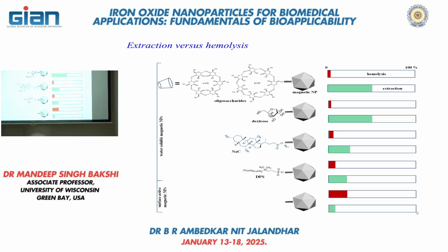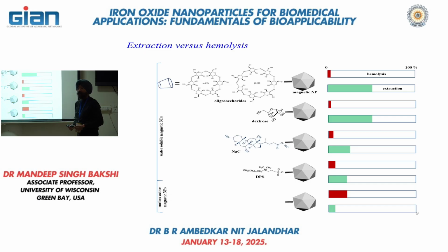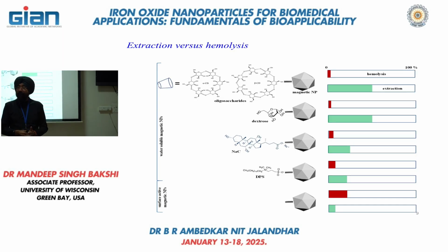And if you ask me, among all magnetic nanoparticles, which are the best performer, I would say that the sugar derivatized, stabilized magnetic nanoparticles are the best ones to extract the blood cell. So you may ask me, when next time you go for the blood test, would you expect the people in the blood lab to use this kind of technology?